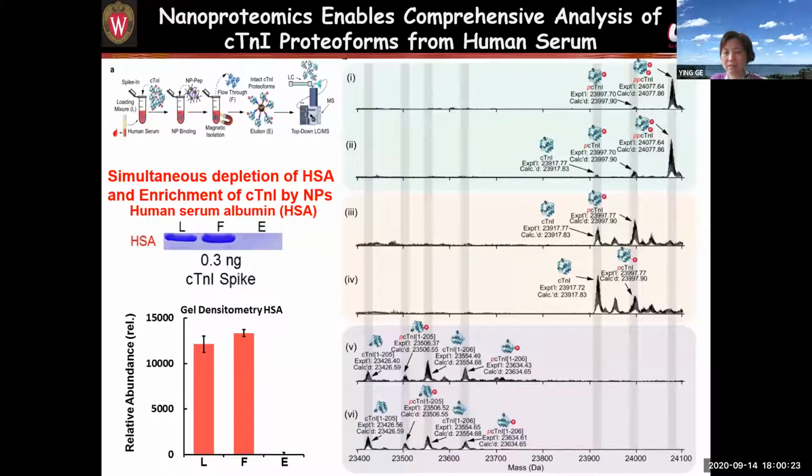But meantime, we realized that for top-down, we don't have so many tools, as you said. We don't have chromatography methods. So I thought your group did some effort to build some using new material.